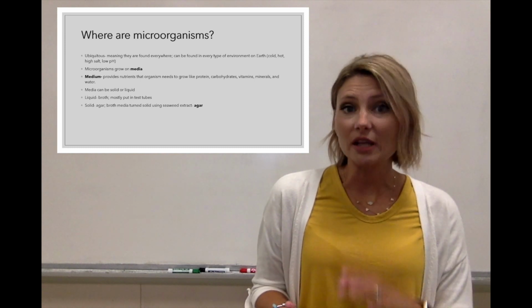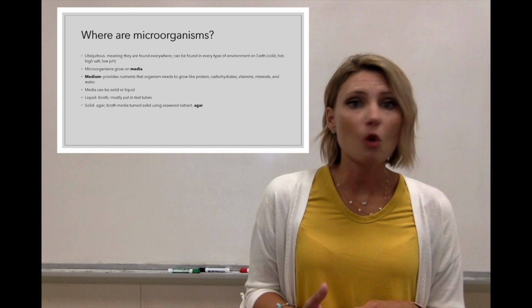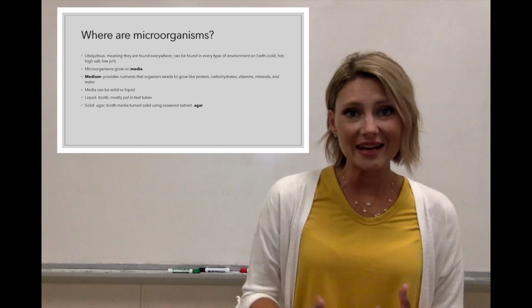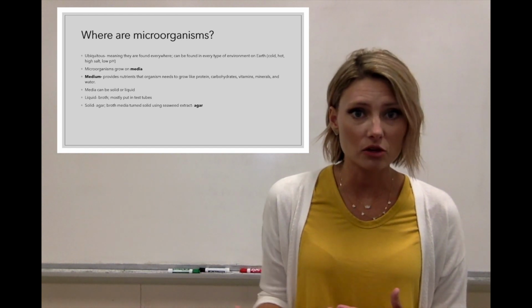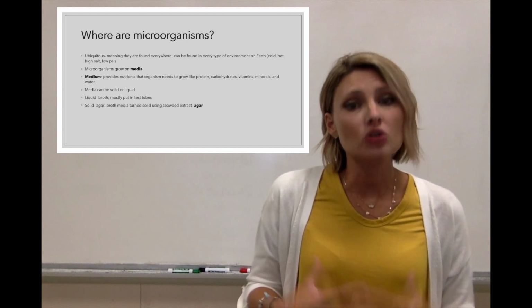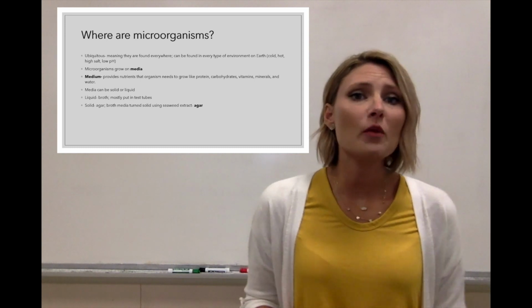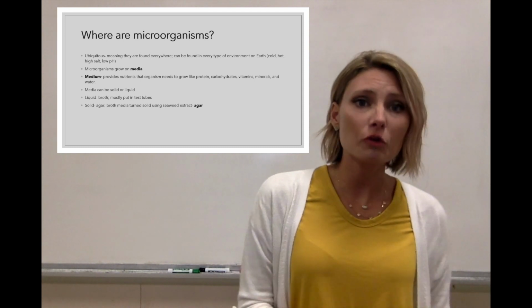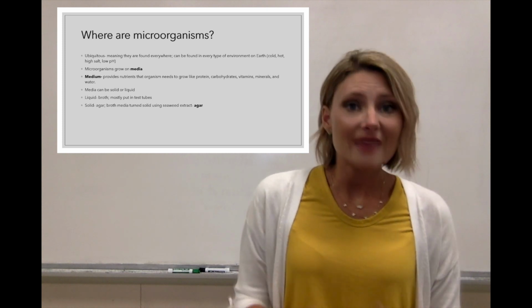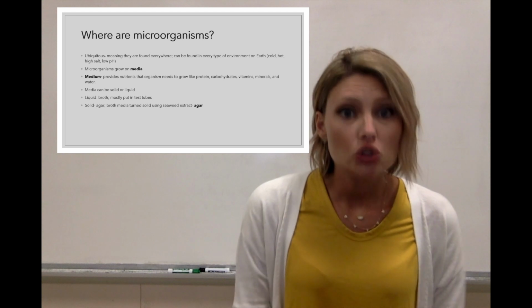We can do some molecular work on it to find out what kind of bacteria it is, or just classical microbiology, where we're staining it and looking at it under the microscope. But to do all those techniques, we usually have to bring it into the lab first and culture it and grow it in the lab. To do that, we use what is called media. Media for plural, medium for singular. And that basically just gives the bacteria its nutrients to grow.